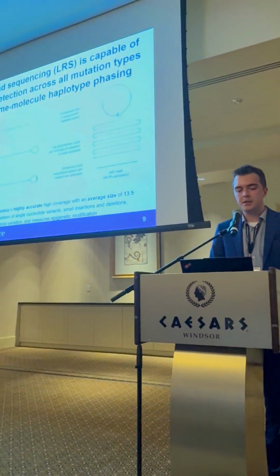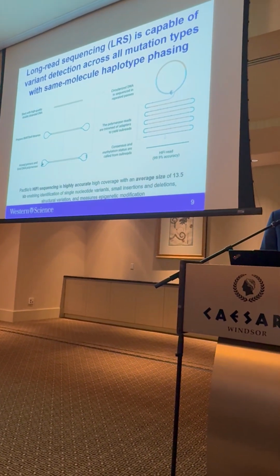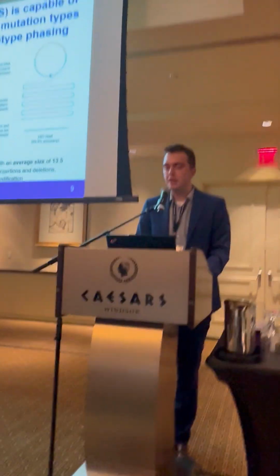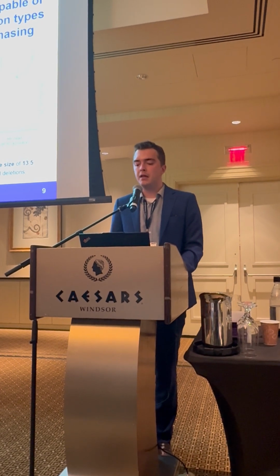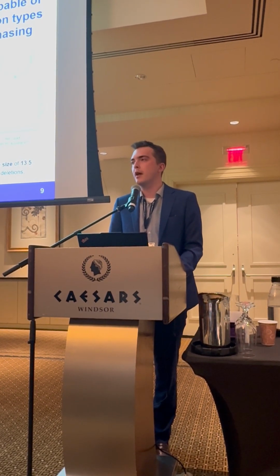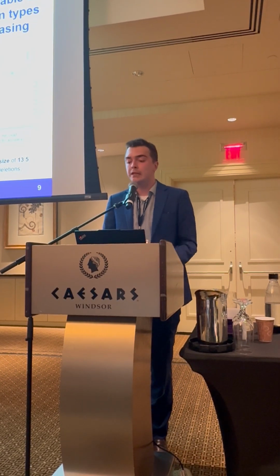Okay, so getting into the materials and methods. In my project, we utilize long-read sequencing, specifically the PacBio HiFi sequencing platform, which is a highly accurate and high-coverage technology that generates reads with an average size of 13.5 kilobases. So really large reads of DNA, which is significantly greater than the read length afforded by typical sequencing platforms like Illumina, where reads are capped at 150 base pairs, so thousands and thousands of base pairs longer.